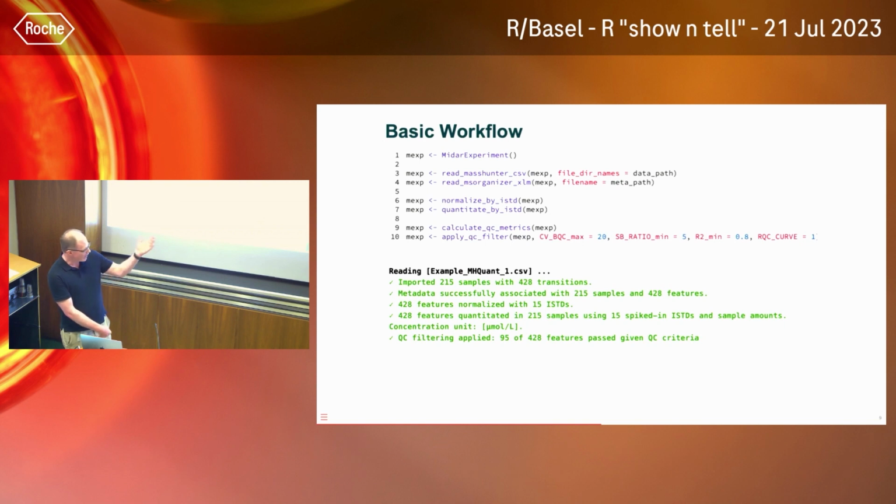And so the idea is really to guide the user a little bit, and to inform the user what's happening, so that he has a feeling of what's going on. I think this kind of thing helps a lot to get people to use it, because they feel something is working, and small successes can really help make life easier in a lab. So we have this output at the moment in the console that describes what's happening, and later I will also show cases where there's a warning or even error messages.